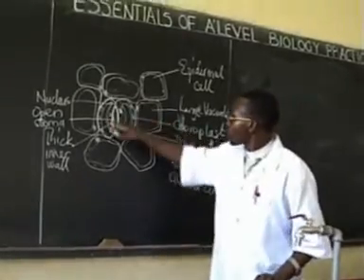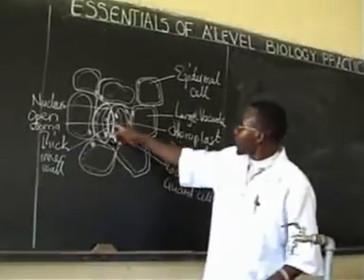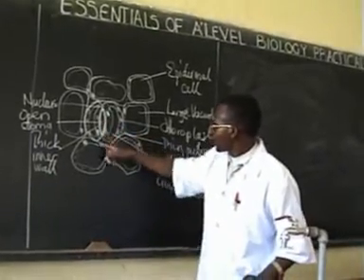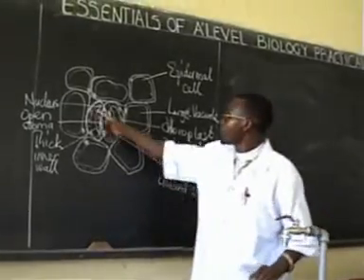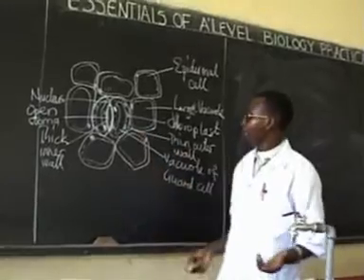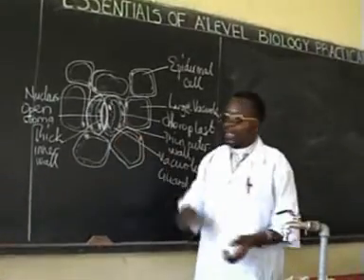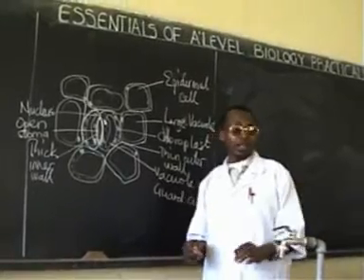We want to know the various parts of the stomata. What has actually caused the stomata to open? So you see that this inner wall here, this thick inner wall, gives a lot of pressure and it pushes the other thin wall, which is to the outside, so it bulges out and the stomata opens. So you now realize that we had irrigated our preparation with water, and water is a hypotonic solution.